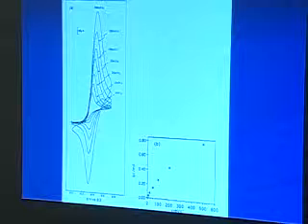That is, the cyclic voltammogram looks that good. You can come up and just sort of guess at the baseline. Yes? Should the peak separations be independent of scan rate? Depends on the mechanism. Okay. Yeah. For reversible, it's scan rate independent, assuming you have zero uncompensated resistance.